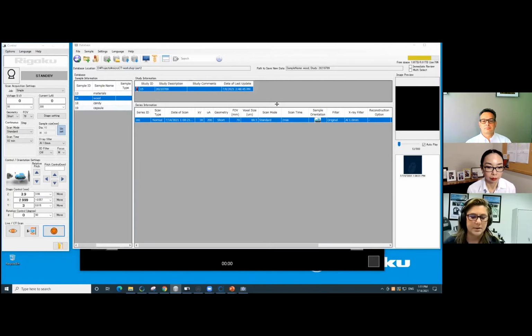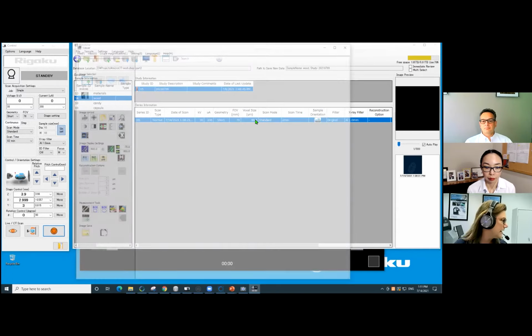All right, so it looks like our scan is complete. And so what we're going to do is we're just going to take a quick look at the results of this scan.